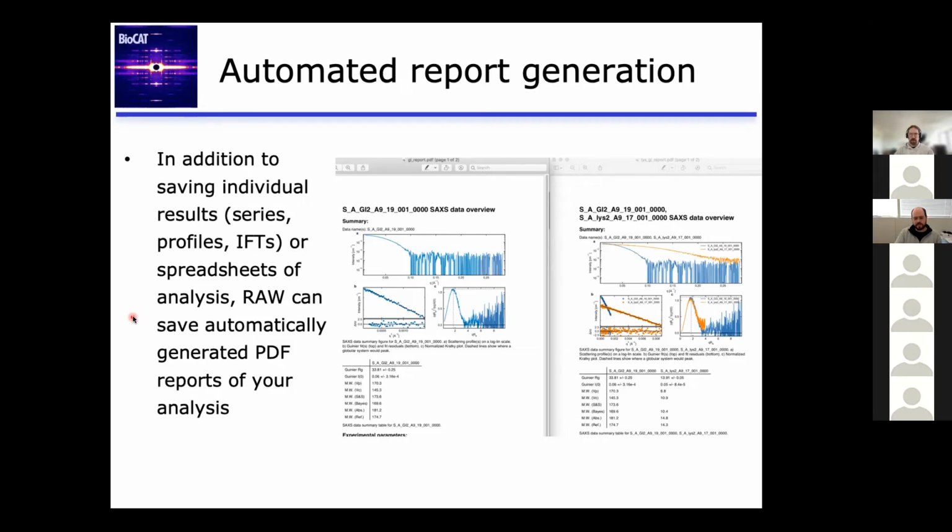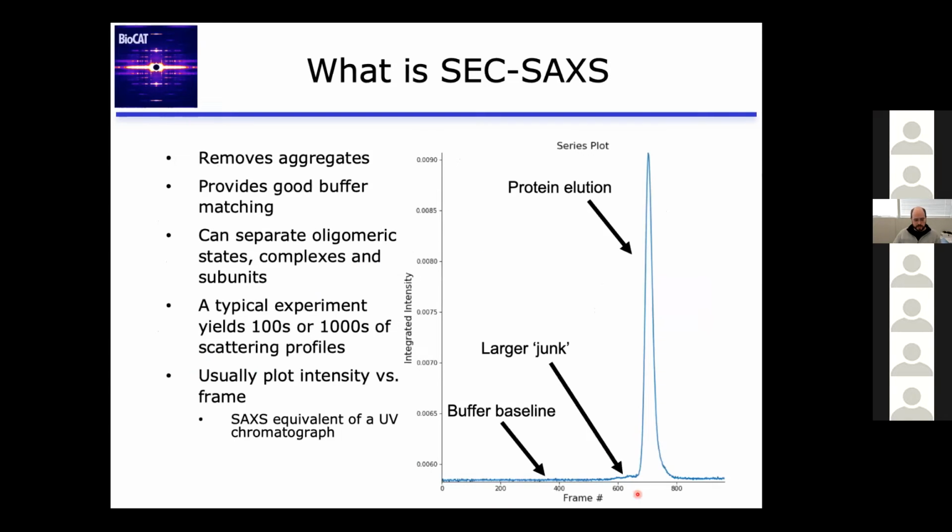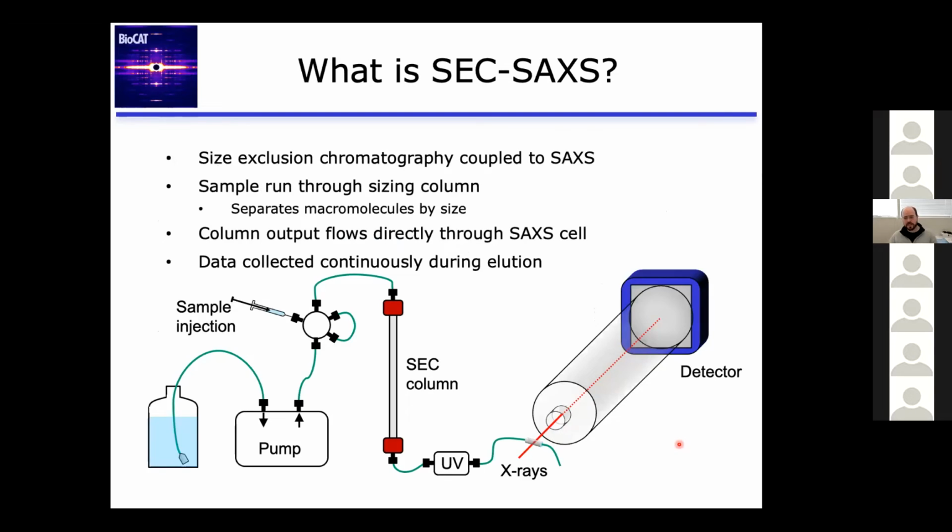Okay, thank you. Yep. So I'll just continue on. We'll take questions at the end as well, of course. Oh, sorry, flip to the next slide. So the next thing I want to do is talk a bit about SEC-SAXS and then how we can analyze that data set.